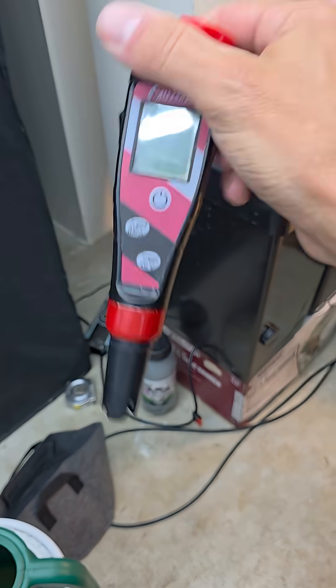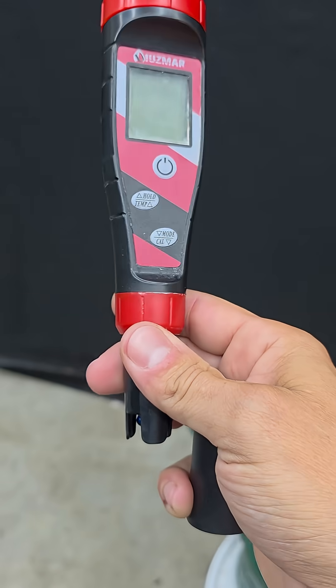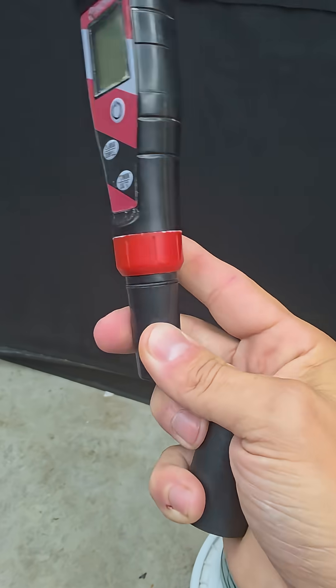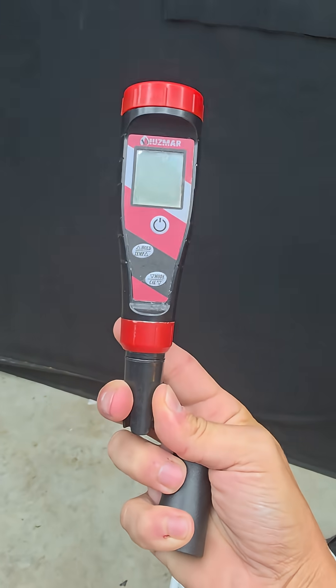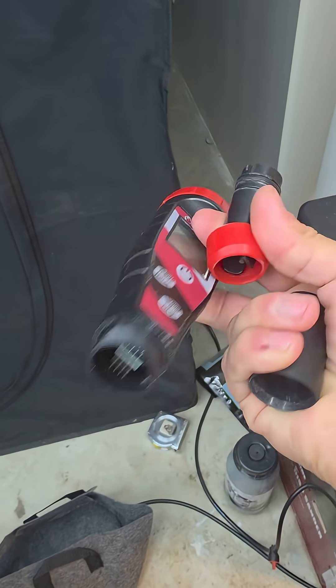This does pH, the EC reading, and parts per million. On Amazon it is still like $25. Also don't quote me on this, but this part undoes and you can pull the tip off. So I want to say the tips are replaceable as well, instead of having to buy a whole new meter — it looks like it's just easily replaceable.